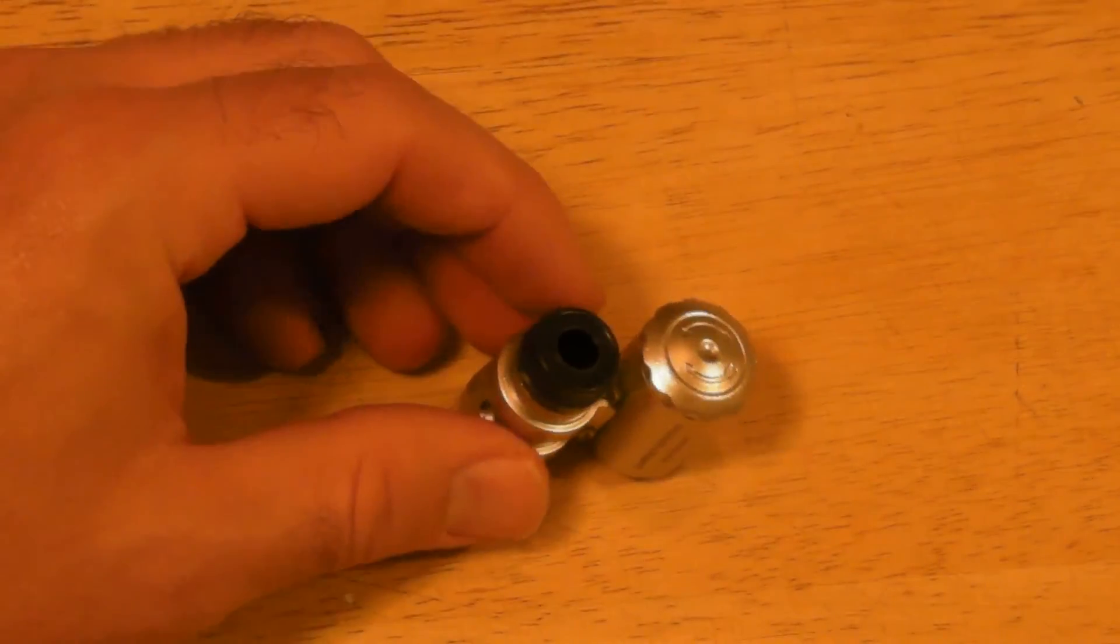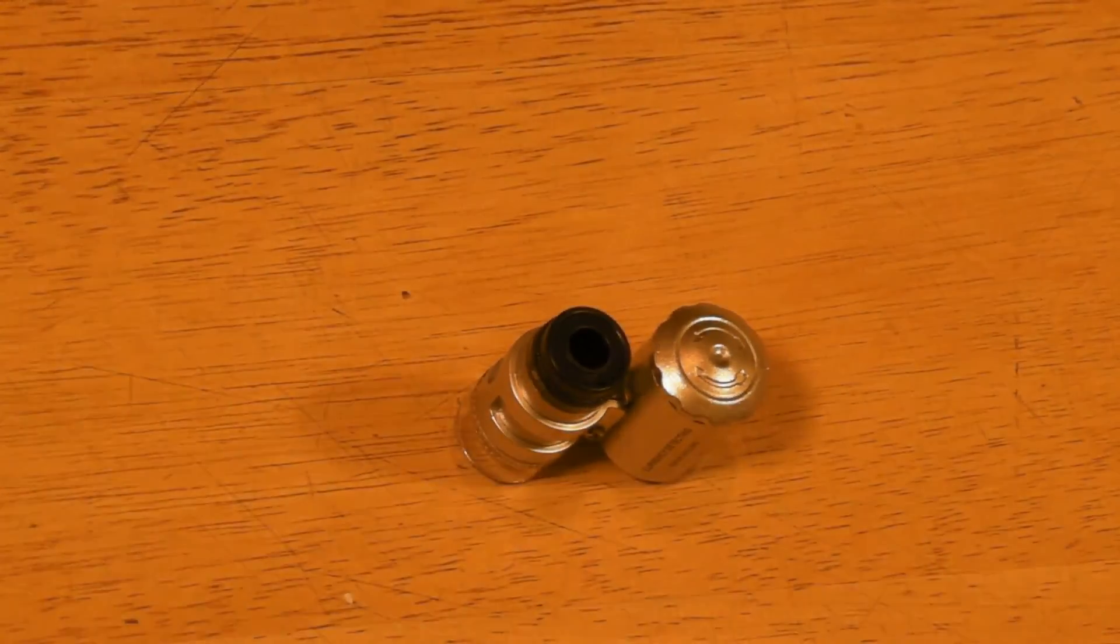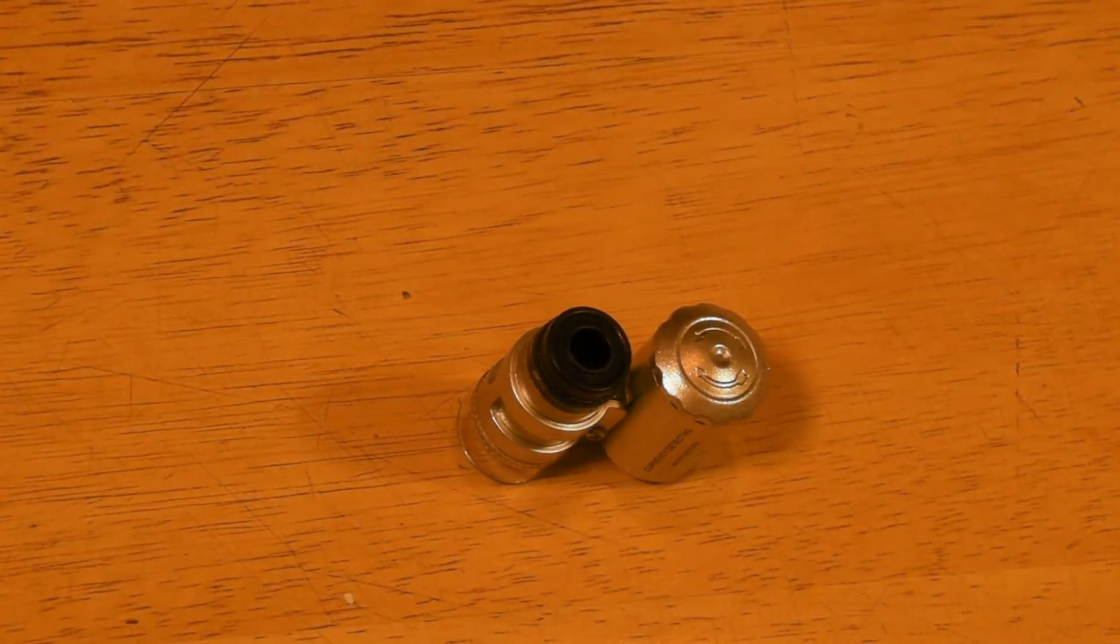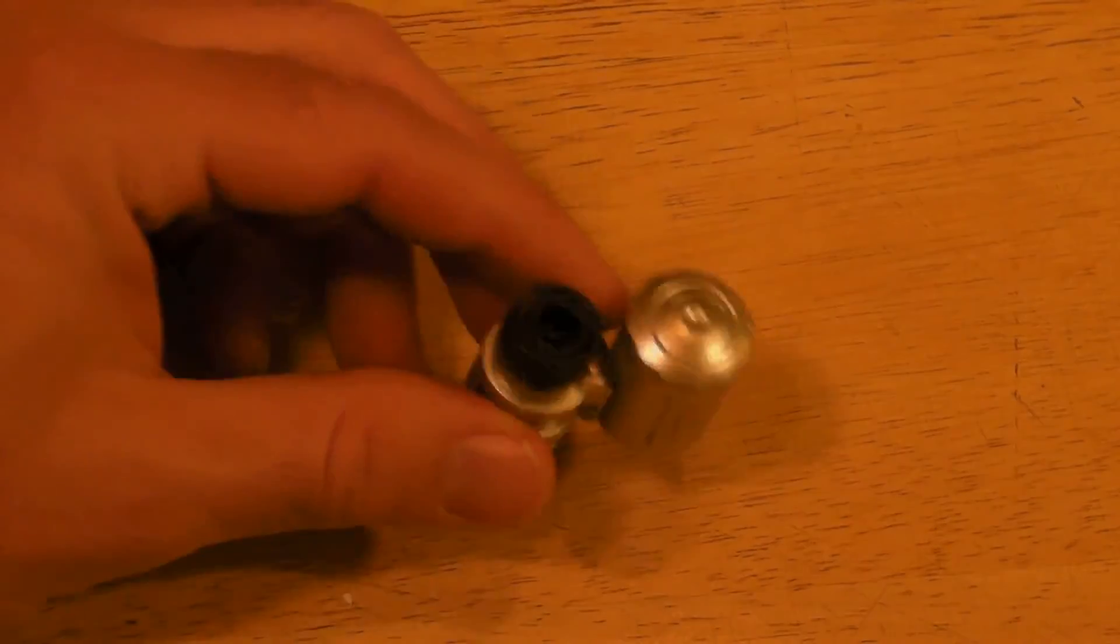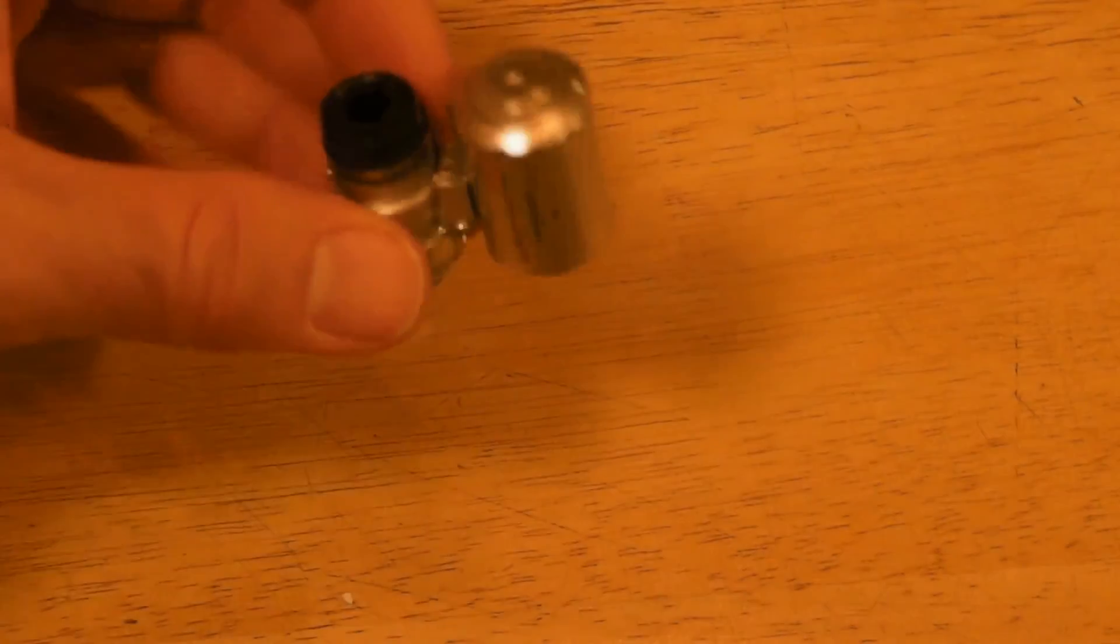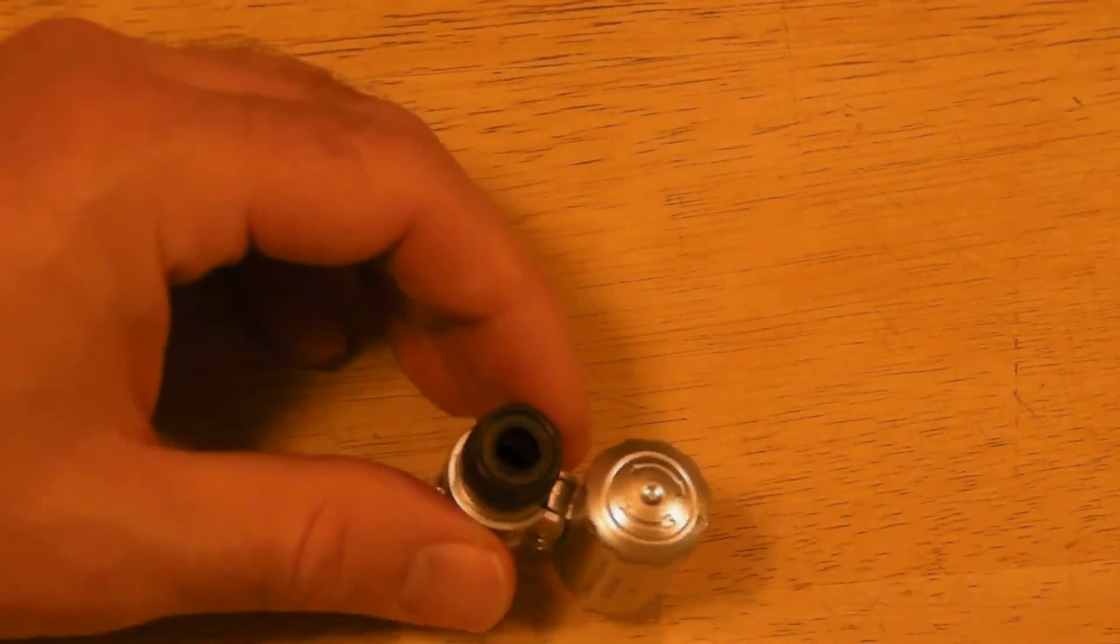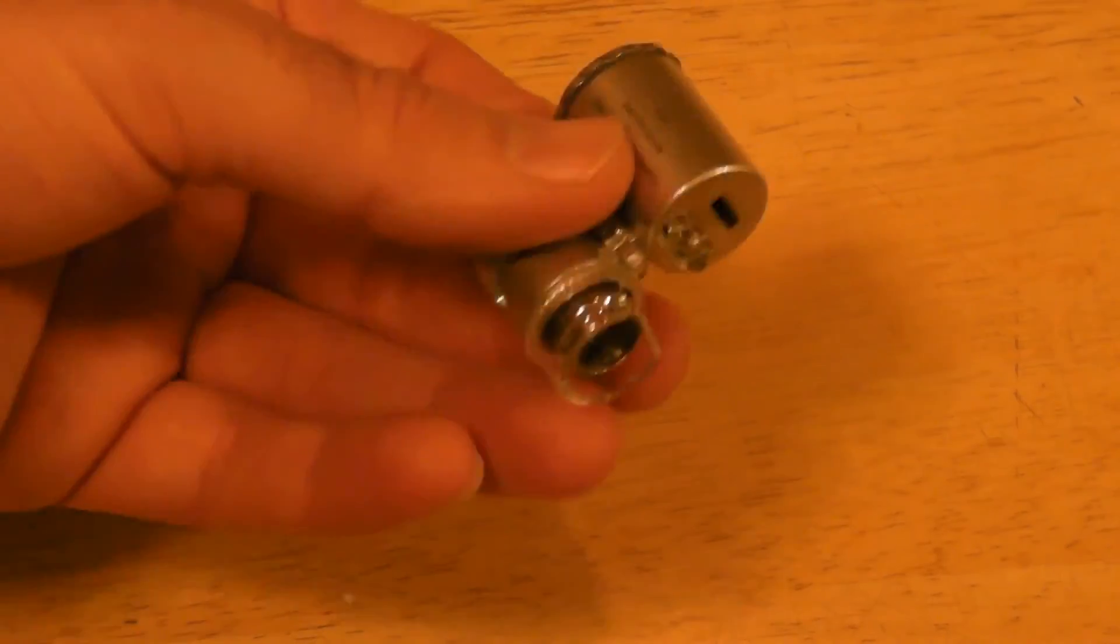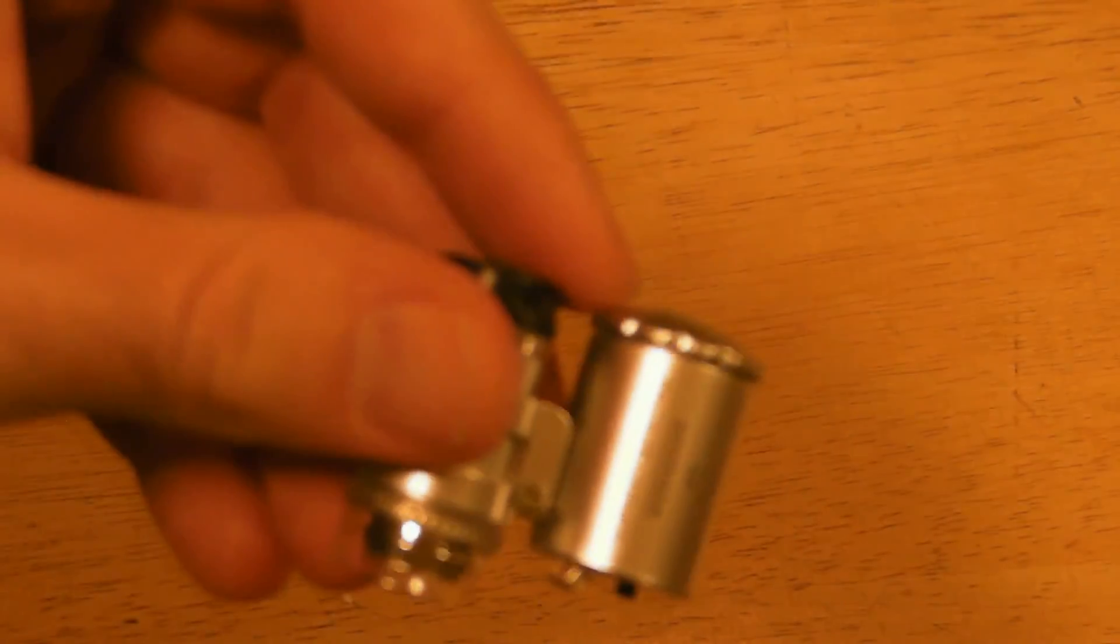You know you have a UV light. You have batteries already in there. You have the LEDs. It's bright. It's clear. I mean this little product is only $2.75 and free shipping. That's pretty amazing. So do I recommend this product. The answer is definitely. This is really cool. Does exactly what they said it was going to do.